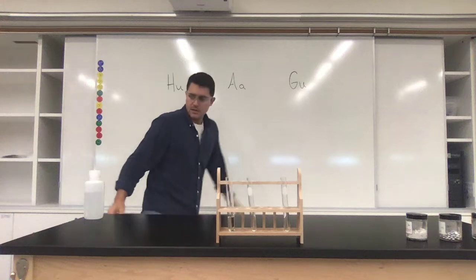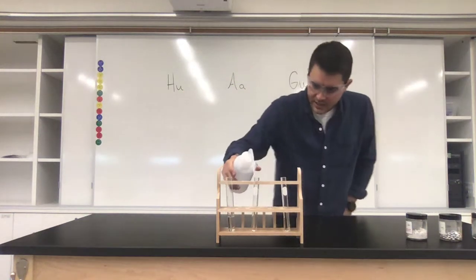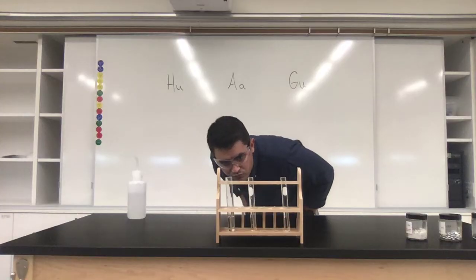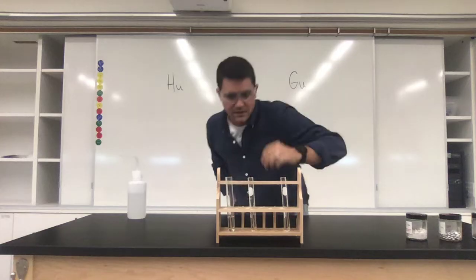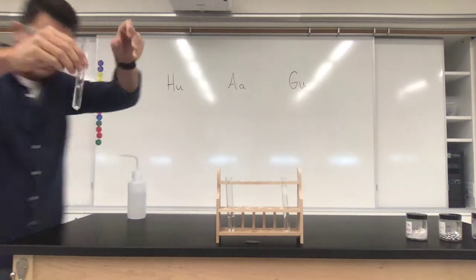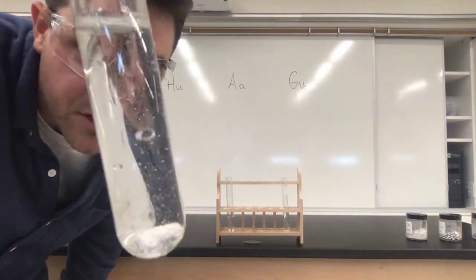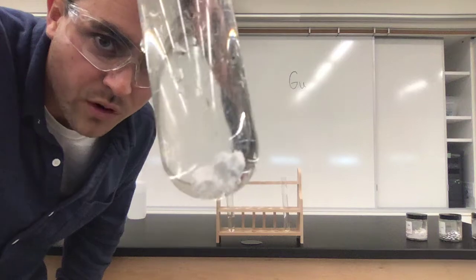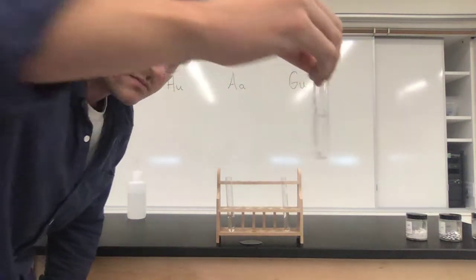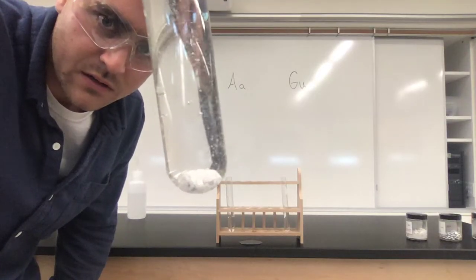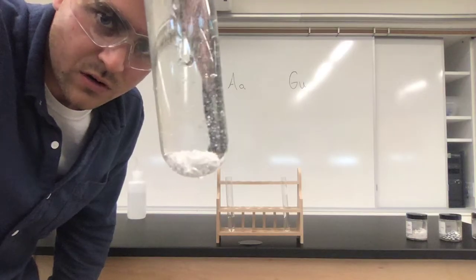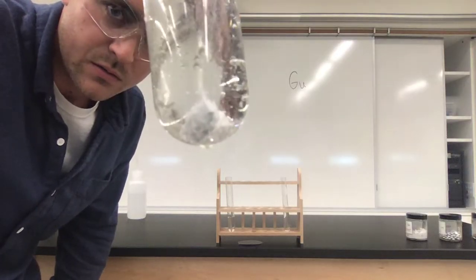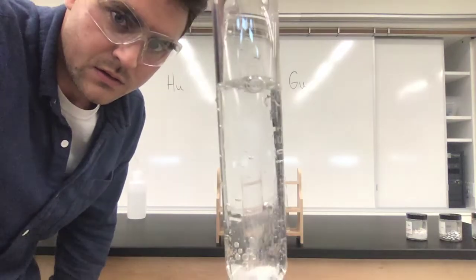There's one at the very top. Some bubbles start to form on the other side. You can see the bubbles. Some bubbles start to form on the piece of metal itself, which is way more than we can say for Gustonium. That's for sure. Let's check out Walonium, chemical symbol AA. Let's see what happens here when I react to this one. Again, I'm going to add just about the same amount of water to this one. Oh, there are some bubbles forming in this one, folks. Definitely some bubbles forming.